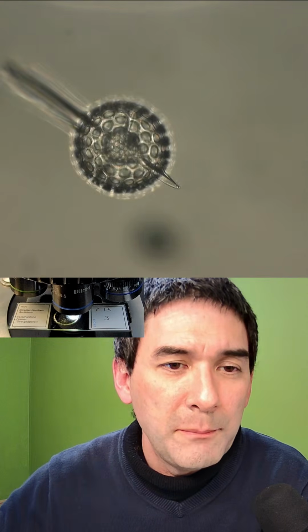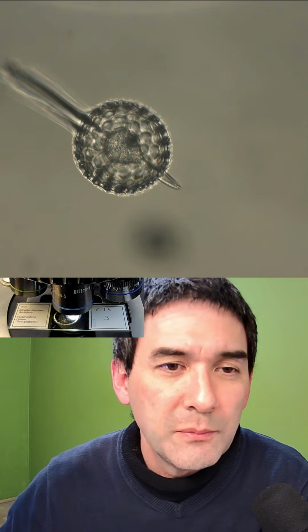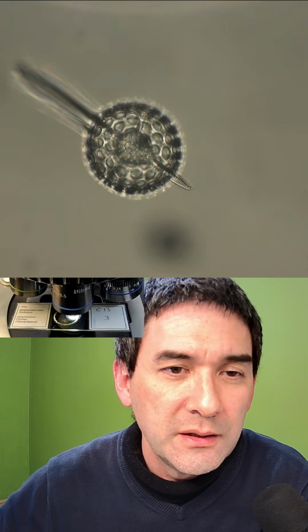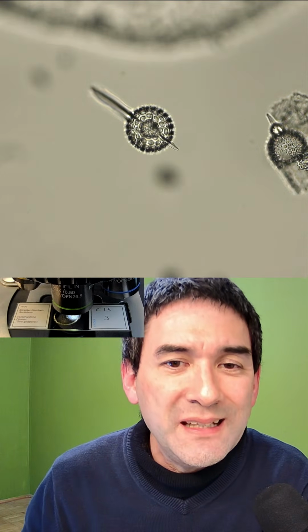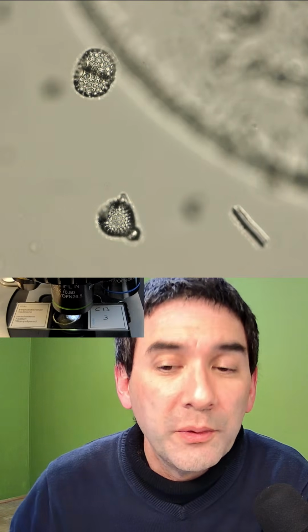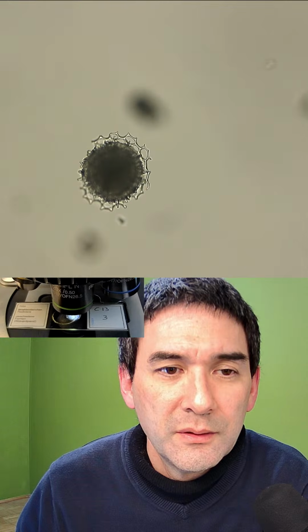But these are basically also single-celled microorganisms, and that's their shell that they have. So those are essentially from water, and they can be found in sand. In certain regions of the world, they're quite common on beaches.